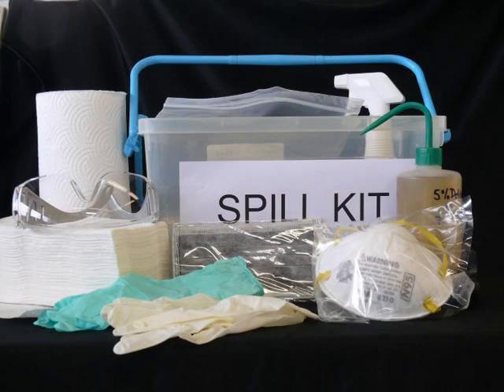In the event of a large spill outside the biological cabinet, a biological spill kit should be used. Follow the instructions provided with the kit.